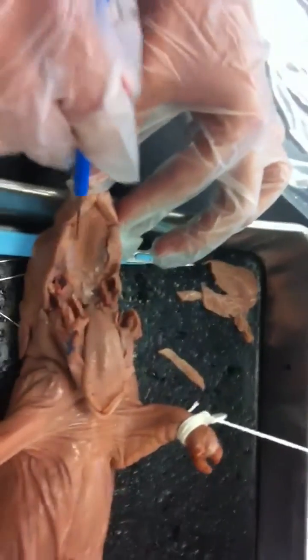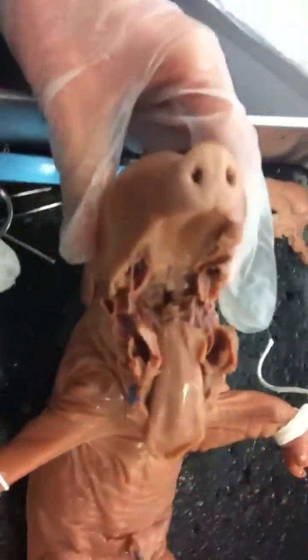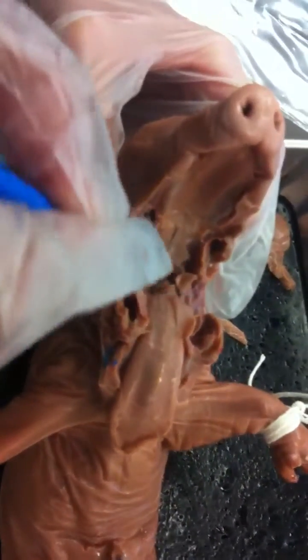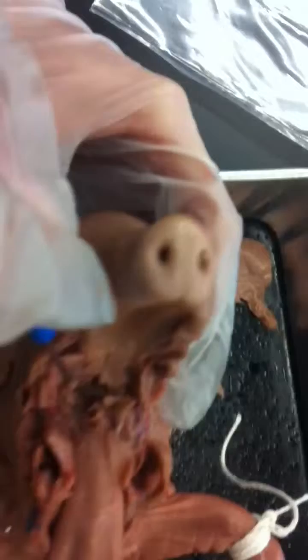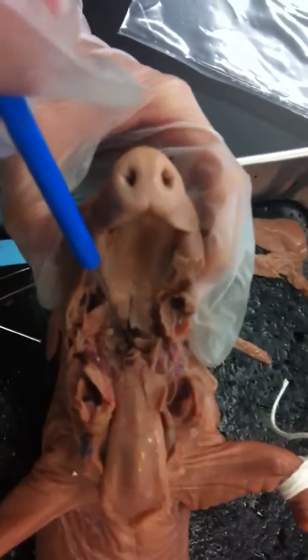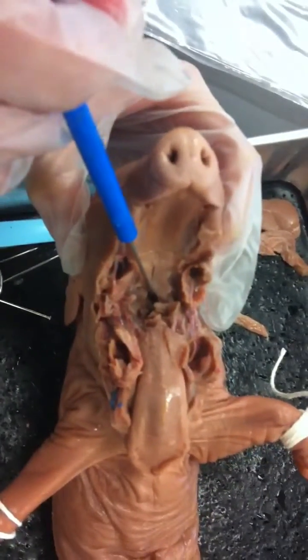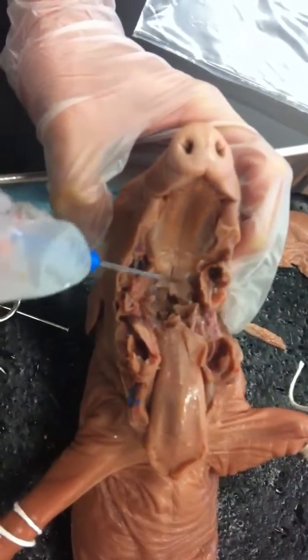Alright, so this up here is the hard palate, and then this down here in the first hole is the nasopharynx, which should be right in here where I'm pointing, and then the soft palate is right here.